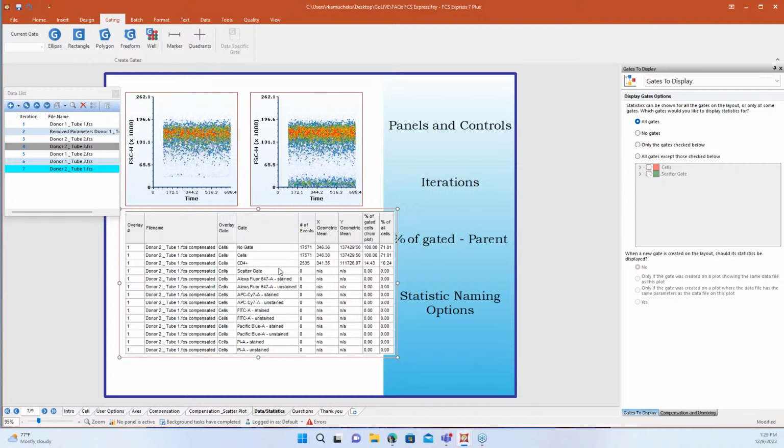And so if you do percent of parent for the CD4 gate, you may be expecting to see the relationship to the cells, right? Because that is the parent gate for the CD4. But what you're actually going to get is the parent to the cells gate. So it would be the relationship from the CD4 gate to the no gate here. And here, what we would see then, we would see that 10.24%. And you'd be like, okay, but it's not matching my plot. Like, what happened? Why is the statistic looking weird? Or why isn't the relationship the way that I expected? Kind of knowing how that works, that the parent is always the parent to the population that's displayed, or the grandparent is the grandparent as relative to the population being displayed on the plot.